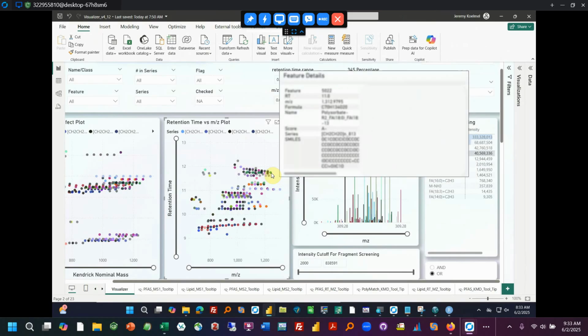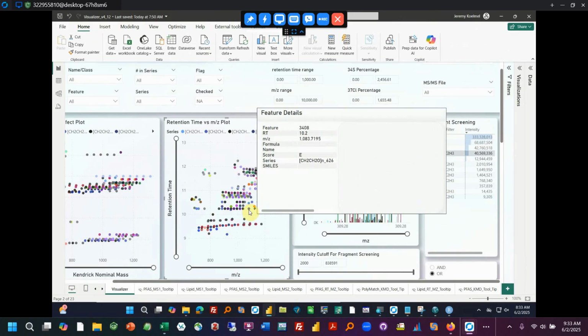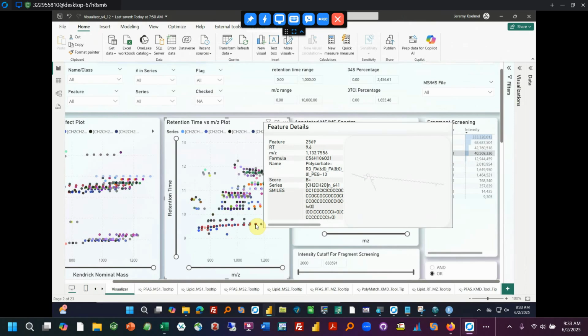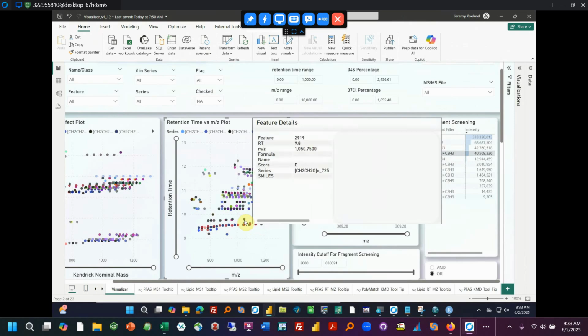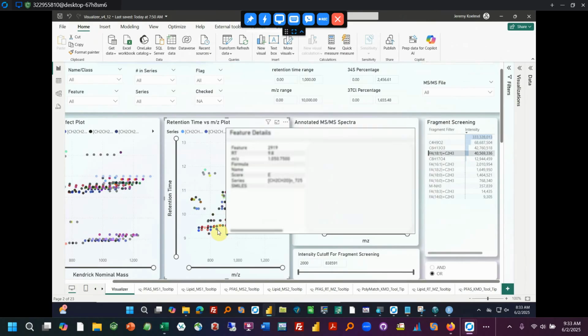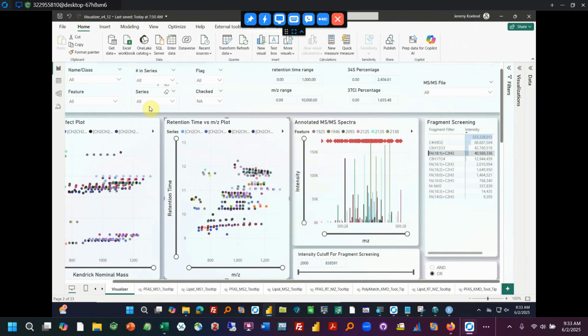You might also end up with species. So here's a lot of annotated species, actually. Such as, let's see if any of these series. So these are still annotated. All right, so this 725, for example, looks like a trend. Same thing for this light blue one. So this is going to be 528, series 528.